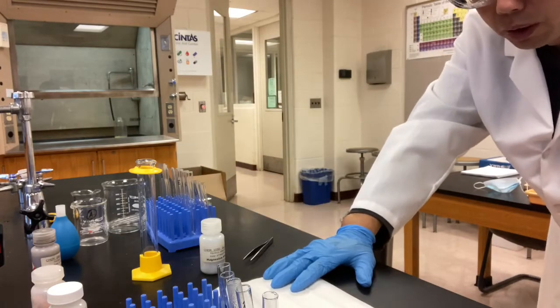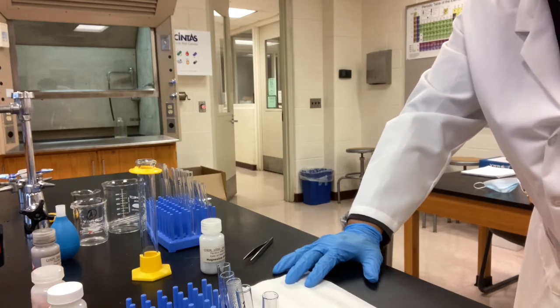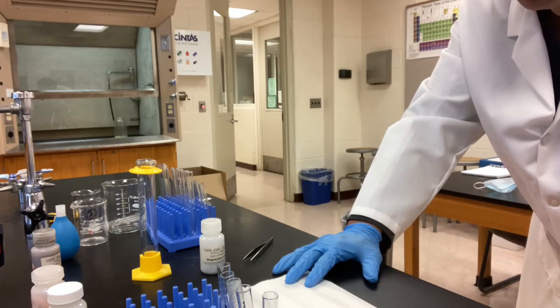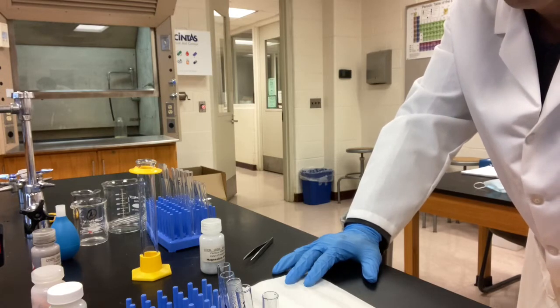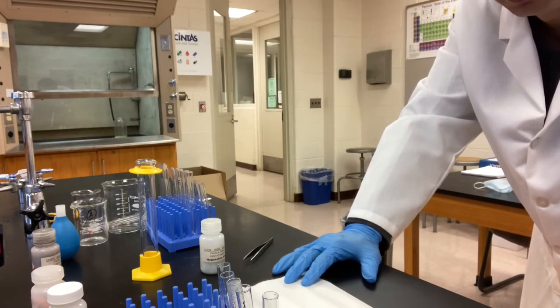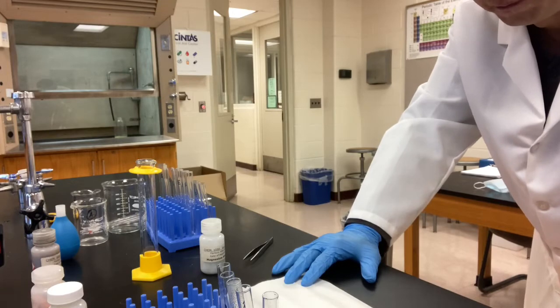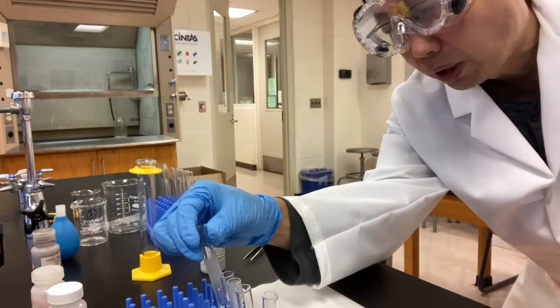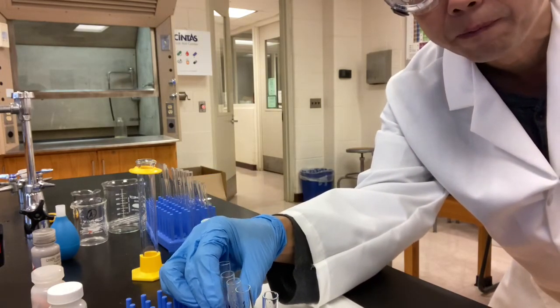Let me tell you what I observe. The first 3, sulfuric acid, hydrochloric acid, nitric acid, the reaction rates are so fast. It's so hard to tell which one goes faster. I would say number 1, sulfuric acid, goes a little faster, followed by number 2 and number 3. Acetic acid actually reacted faster than the phosphoric acid.